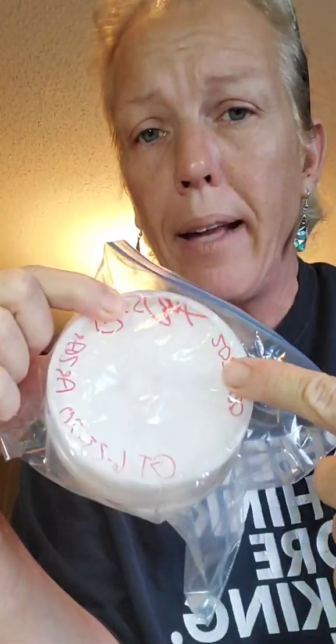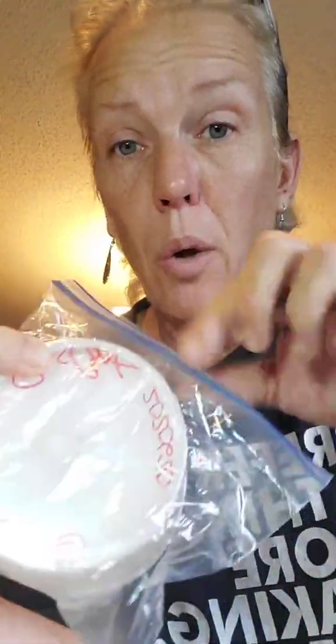This is also a very good way to prevent anything else from getting contaminated. If something in here goes bad, it was bad from the beginning. And so this whole thing, I wouldn't try to save any of these plates. It would be in the trash. That's just the way it is with me. I don't mess around.